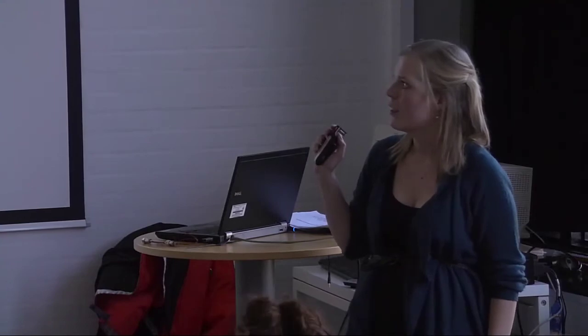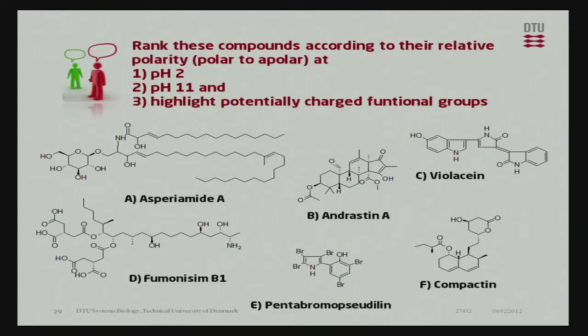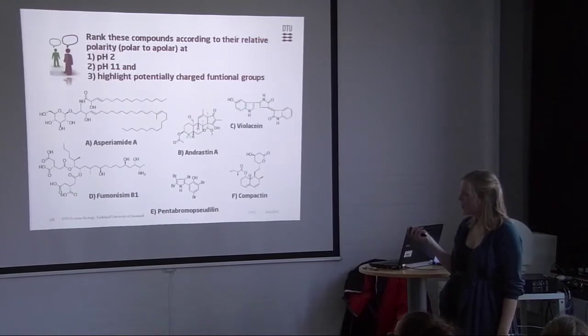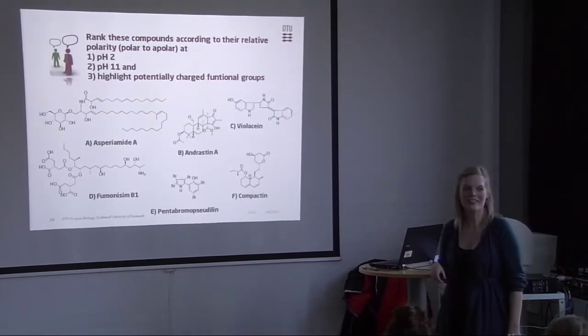So did any of you have an idea, when we're looking at pH 2, which of these compounds represents the most apolar one, which is the further right end of the scale? Any ideas? I know some of you got the answer. I would say A. Yeah. And why is that? Because it has this big apolar part. Yeah. So it got this long aliphatic chain, which fits like a hand in a glove with the C18 that Christian showed before. So even though it actually got this sugar unit sitting on here, it doesn't matter compared to all these carbons sitting out here.